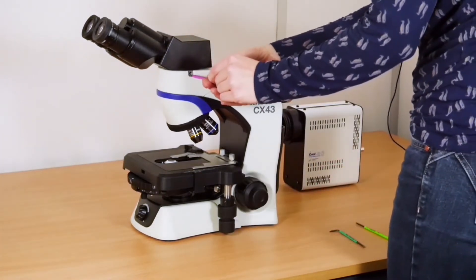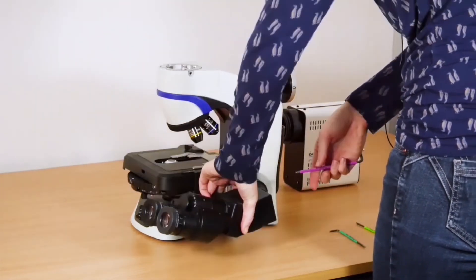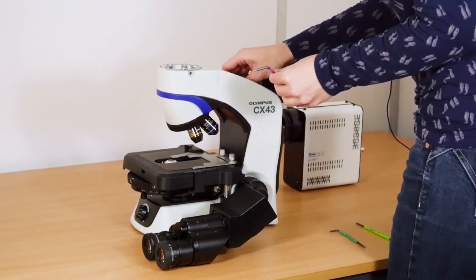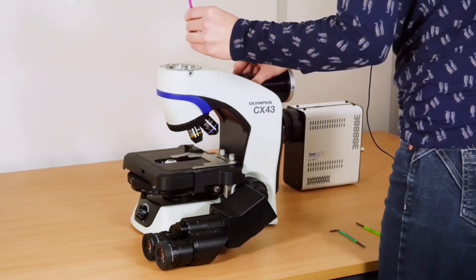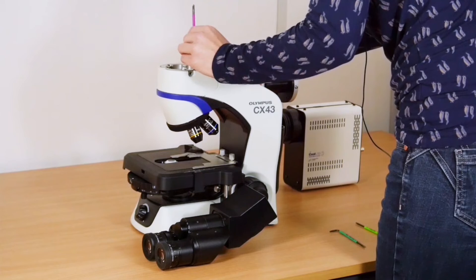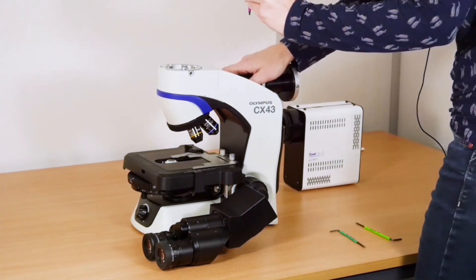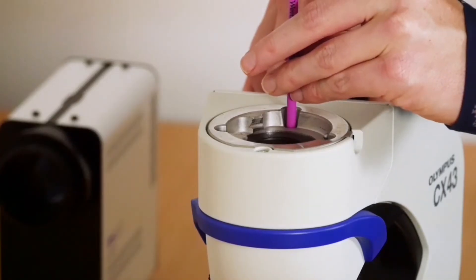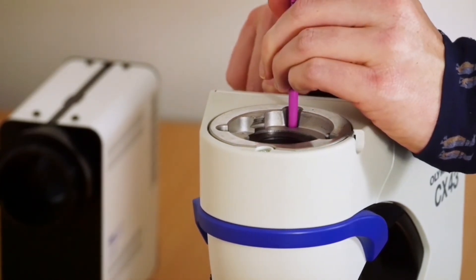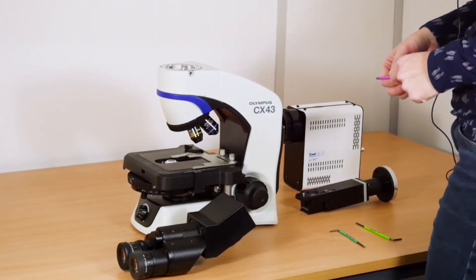Now remove the eyepieces. And now, the screw that prevents the adapter from coming out — you need to depress this so you can then remove the adapter. Using the hex key, you can see the screw is pulled out as far as it can go. Simply push this down and remove the adapter. Then replace the eyepieces.